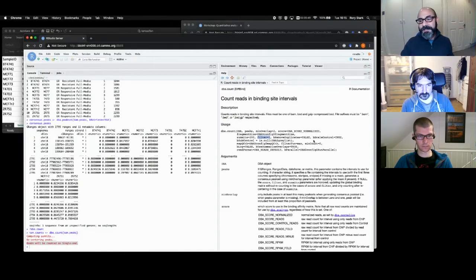Generally, we keep duplicates in. I've actually done a whole bunch of work recently on duplicates in general. For single-end sequencing, you should definitely keep the duplicates in. If you have paired end, you might want to remove them. But in general, duplicate reads, duplicate alignments in DNA enrichment assays are more likely to be true biological signal, because we get very high pileups in very narrow regions. So there's got to be duplication. And then there's an issue of what to do with the control, and I'll come to that.